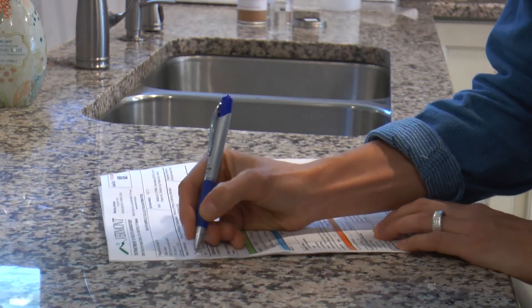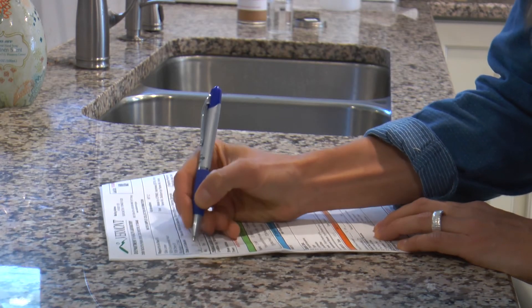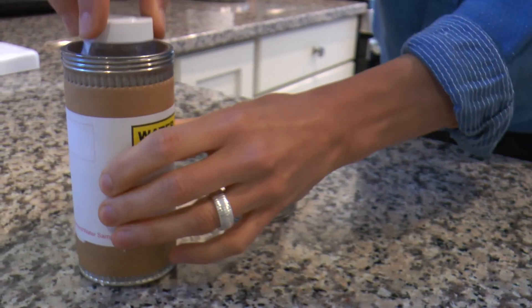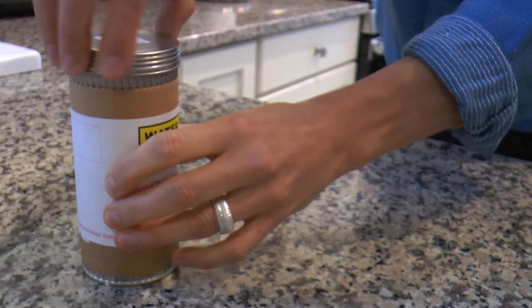Fill out the form including name, date, time and location. Put the bottle and form in the cardboard mailer and screw the cap on tightly. The sample should be kept cool and must arrive at the lab within 30 hours. You can drop it off in person or ship it.